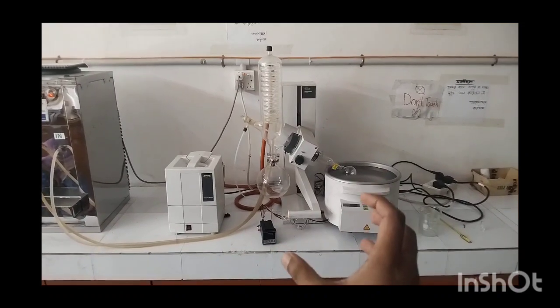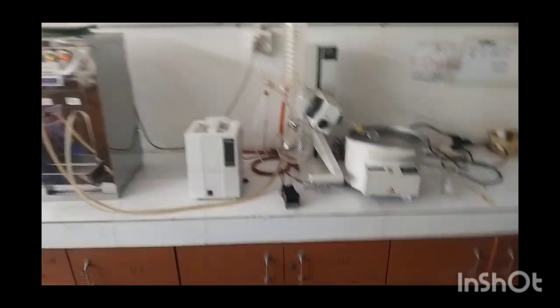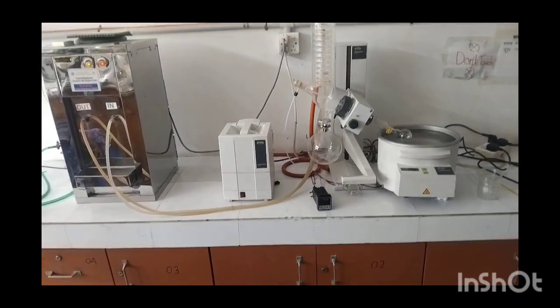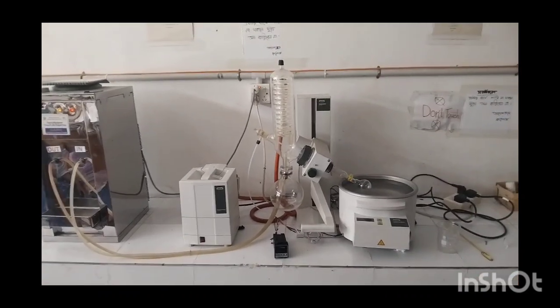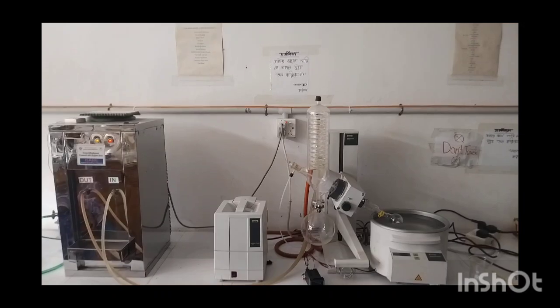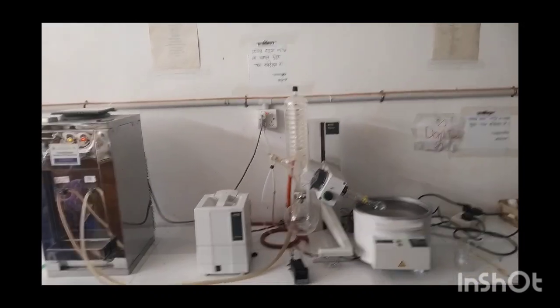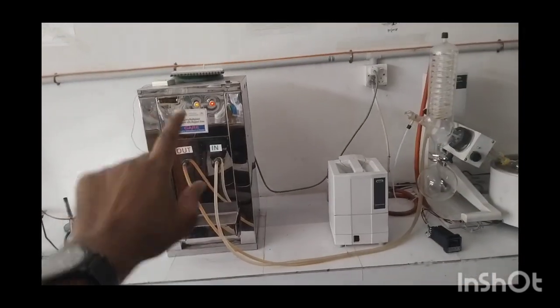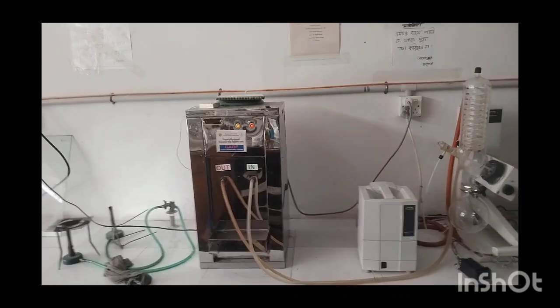At first you are seeing that in the right hand portion that is called the heating bath, and in the middle portion the part of this operating system that is called the Rotavapor, and in the third portion that is a vacuum pump. Actually when you'd like to use this specific system, you have to be concerned about each and every part, because without being careful you will not be able to dry your mixture properly.